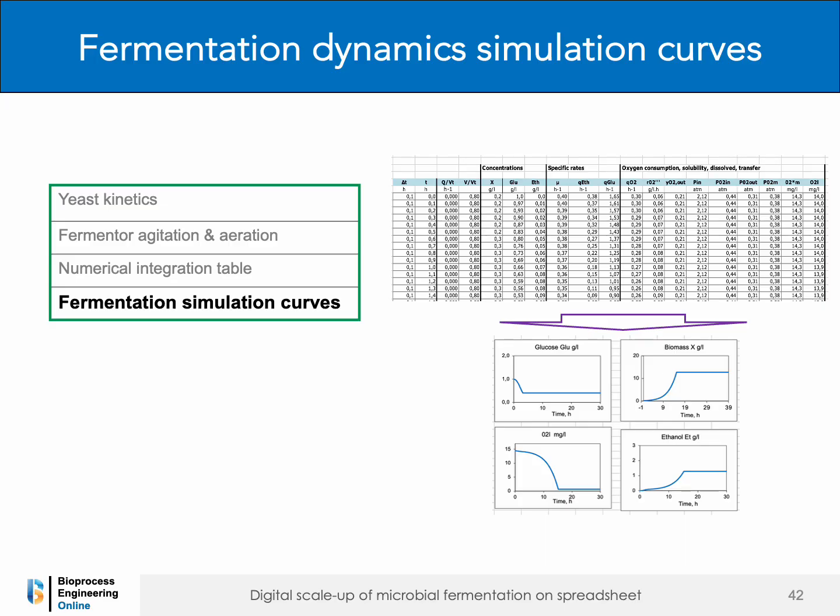The results of the numerical integration table calculations, namely the time evolution of component concentrations during the fed batch, are displayed in the Simulation Curves section of the spreadsheet.